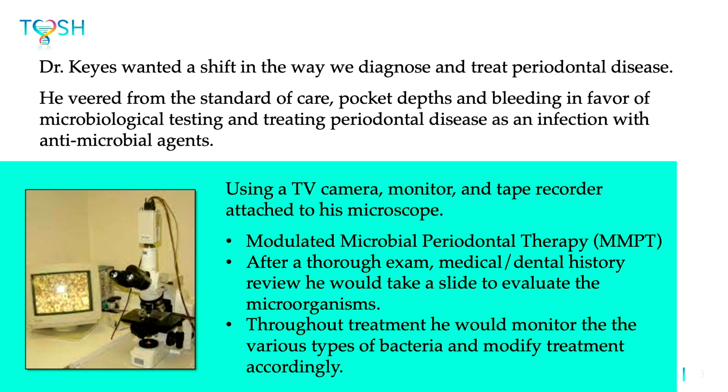It's really much the same as what we're doing today, that intense medical dental exam, looking at what makes that patient individual. But then on top of that, he would simply take a microscope slide to see if there was any pathogenic bacteria associated with gum infections and gum disease. If he did find bacteria, then he would use antimicrobials and follow that patient through therapy, taking a slide each time, with the overall goal being decreased volume and decreased motility of those pathogenic bacteria.